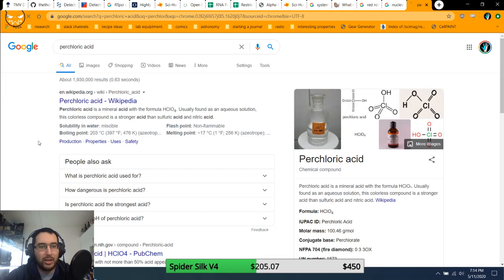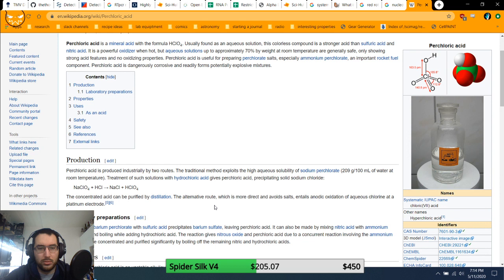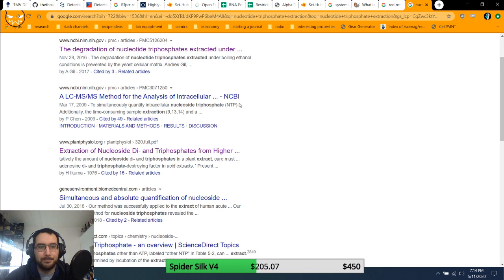Wait, perchloric acid. What is perchloric acid? Perchloric acid is a mineral acid. Wow, that's really dangerous. Or the high aqueous solubility of sodium perchlorate. I do not have sodium perchlorate. I have sodium hypochlorite. Yeah, I don't have perchlorates. That's a problem. Okay, well, rip.